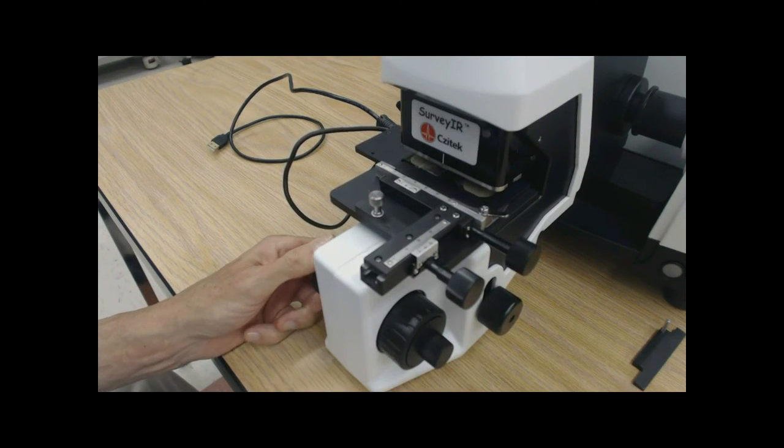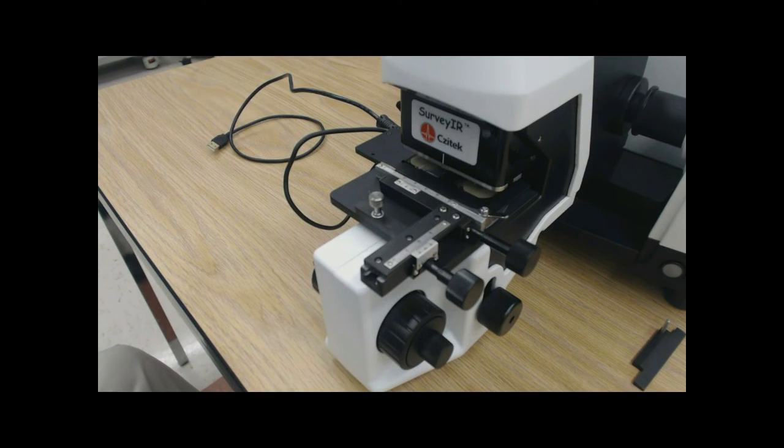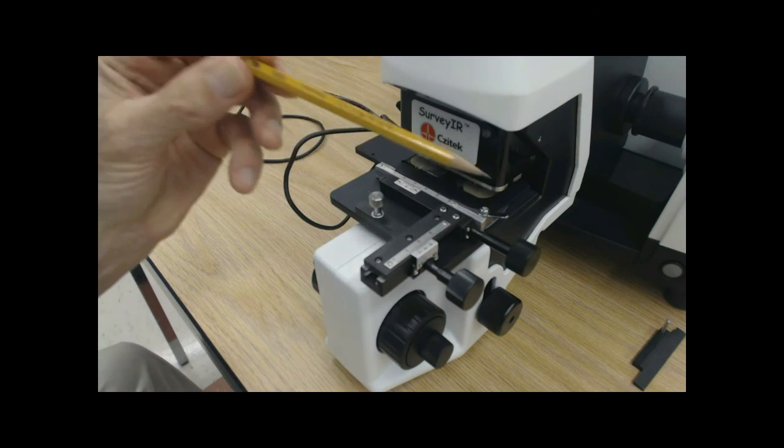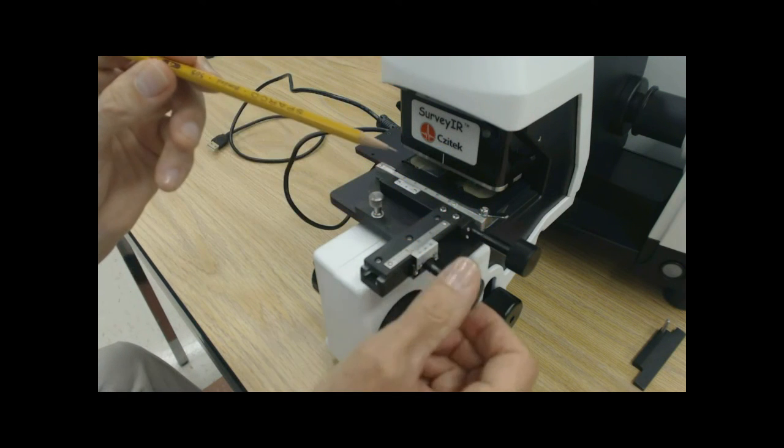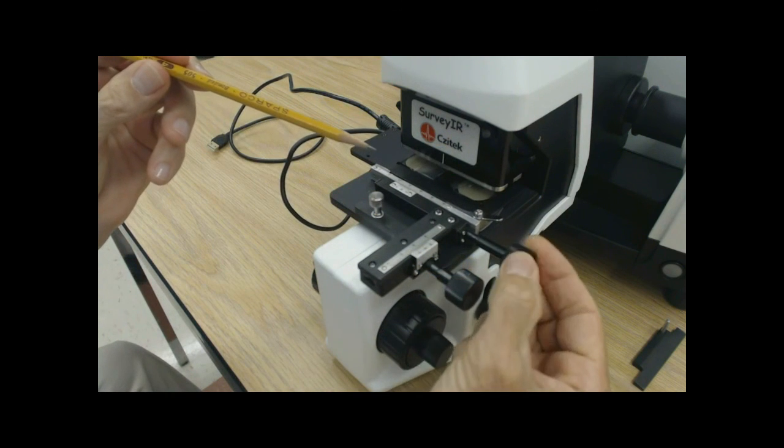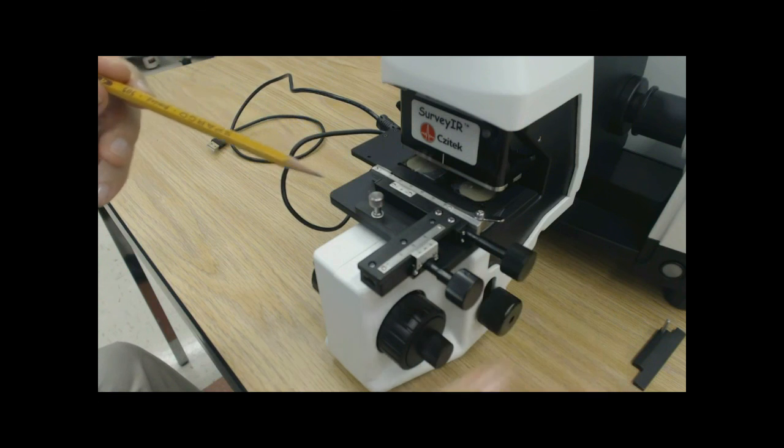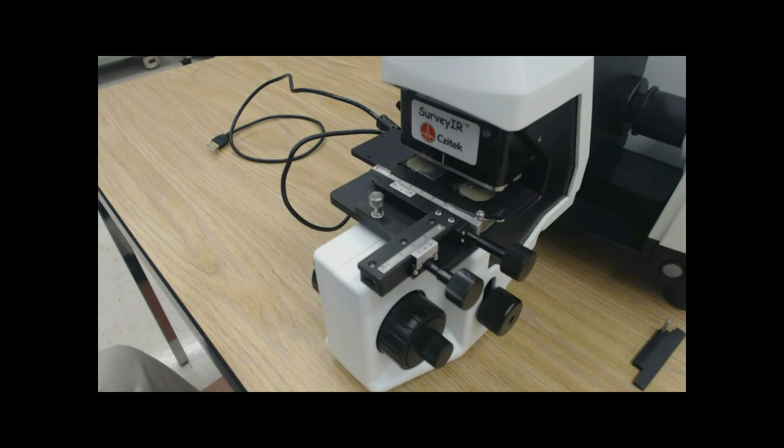We have coarse and fine focus controls located at the very front and easily accessible on surveyor. We demonstrated previously the sample XY motion in the 1 by 3 inch slide clip. Finally, for transmission samples supported on transmission windows or samples that are sandwiched in compression cells, we need to adjust the condenser focus.